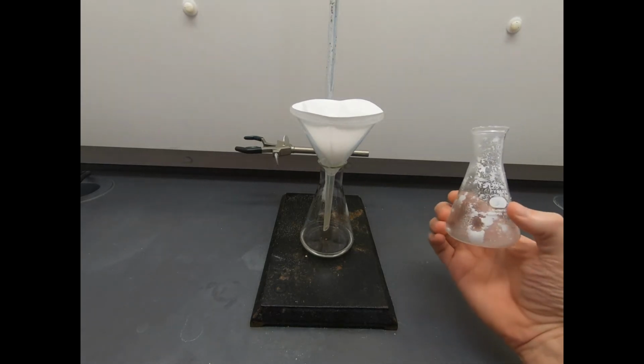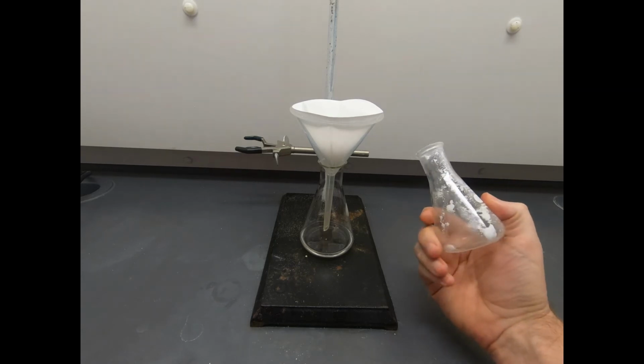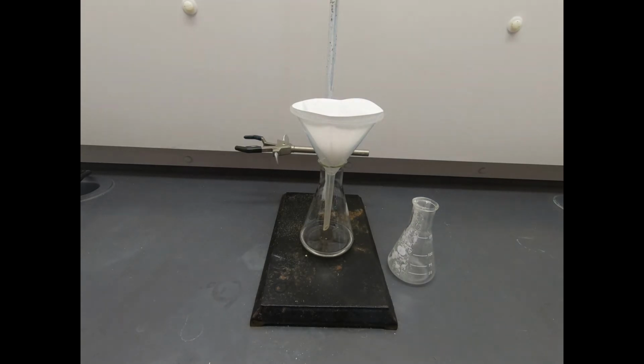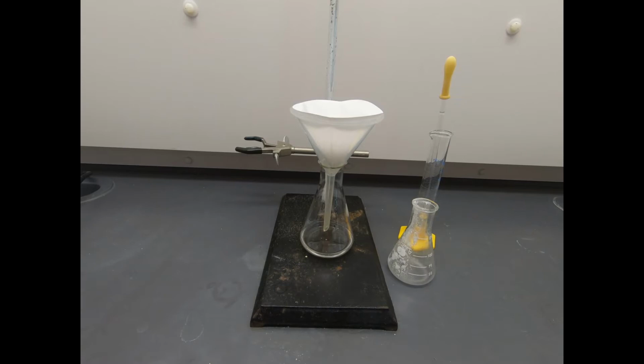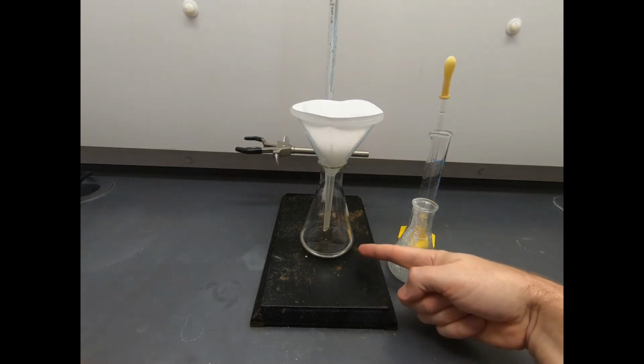Now these solids, we want them to be solids, but presumably there could be some products sticking to these solids, as well as the solids that we've collected in the funnel. So I'm going to use a small amount of isopropanol to rinse all this down. Now we don't want to use a lot of isopropanol, because the next step is we're going to mix this isopropanol solution, which contains our product, with water, and our product is going to precipitate out.